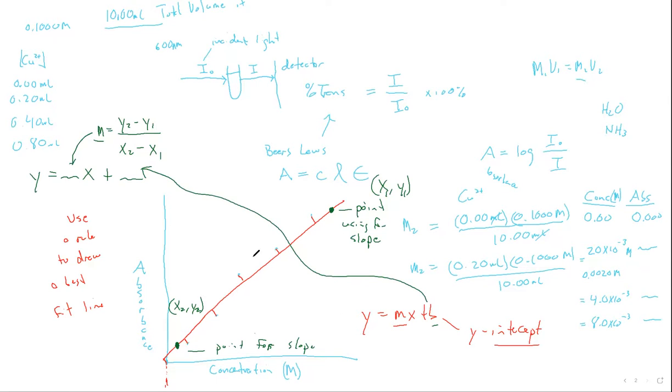And now you can put in any value for absorbance and then calculate the concentration, right? So now when we throw the unknowns in, you just put in the unknown, that'll be the absorbance. And then to calculate, it would be Y minus whatever this B was, divided by whatever the slope was, will be your X. And so you can calculate, right?